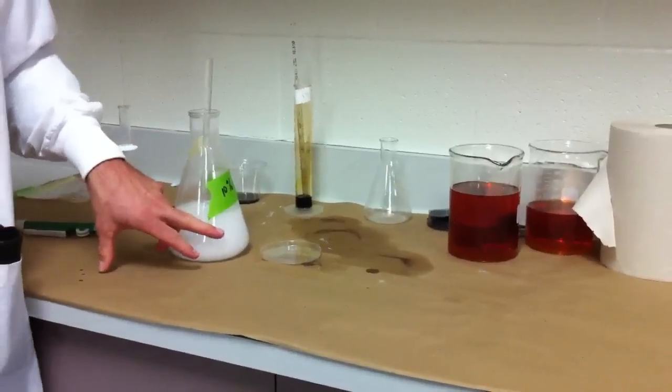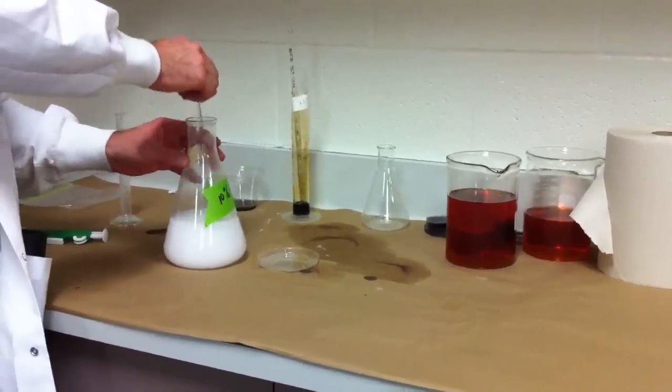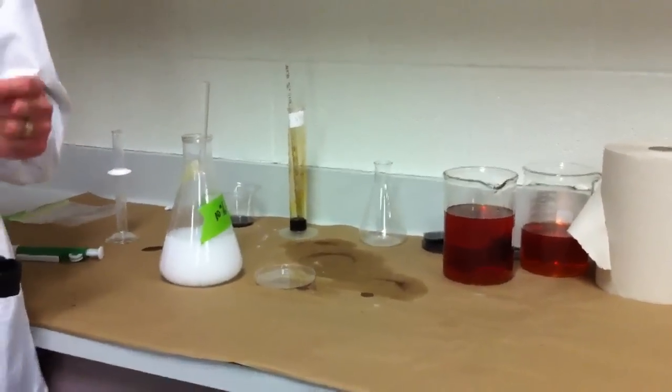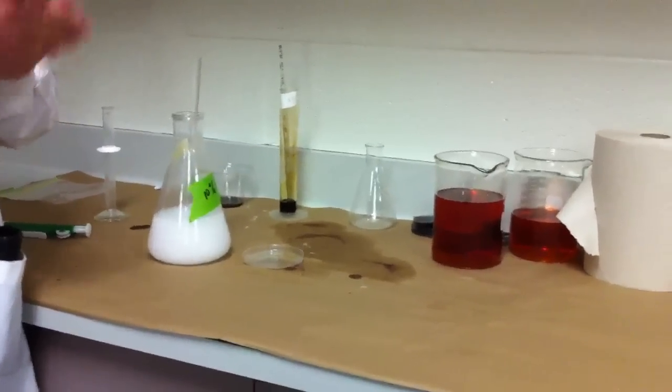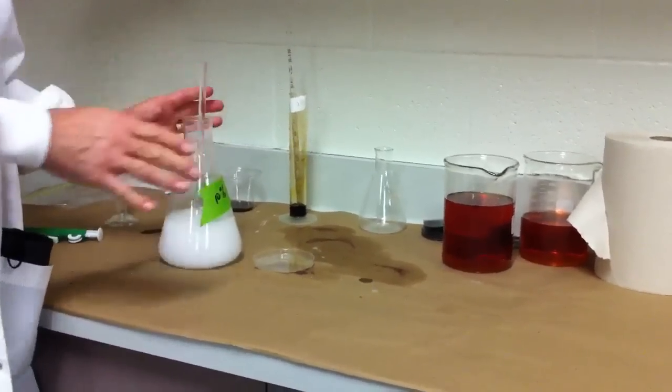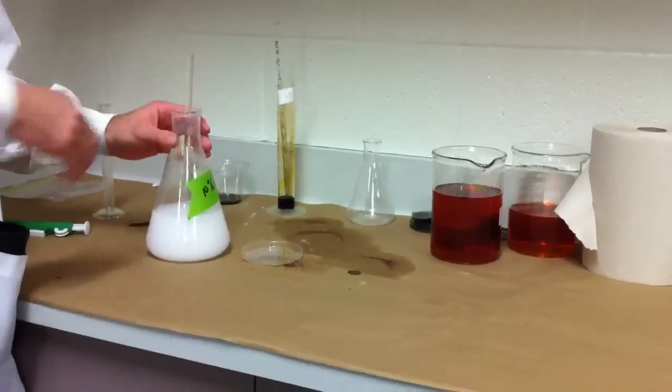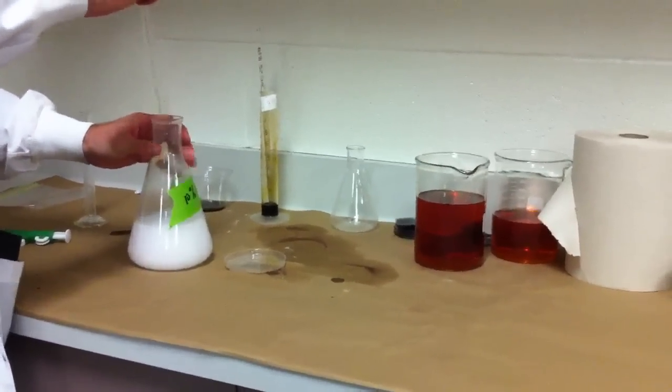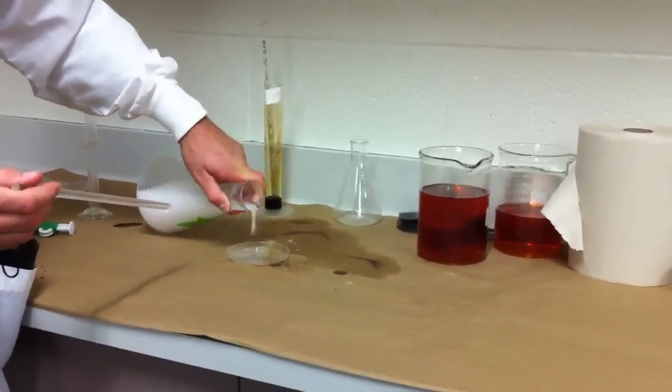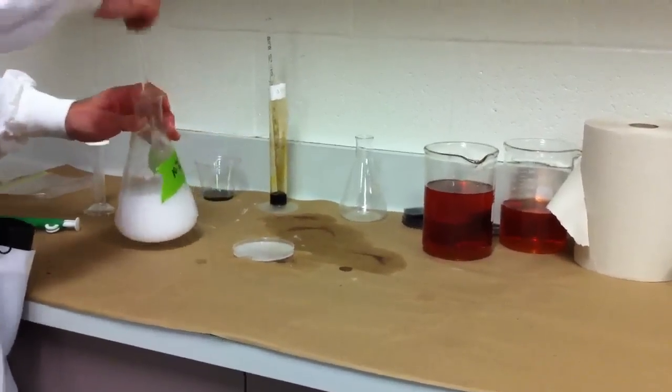All right, so I've got my starch solution. In the 10% starch solution, what I'm going to do is first show you what an indicator can do. So we're looking at just clean starch, all unadulterated. It's white, dissolved in water. I'm just going to pour a little bit of it into the petri dish.